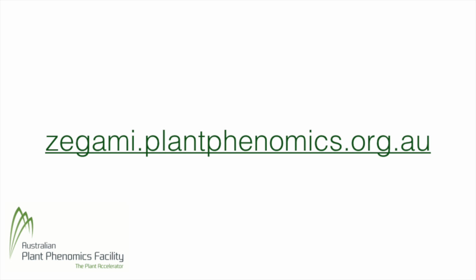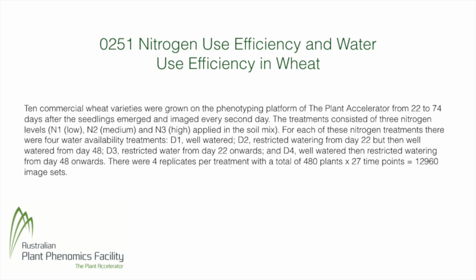Now you know where it is, let's talk about what it does. Zegami allows users to filter, sort and chart data with the unique feature of being able to group that data with the corresponding images. As our example, we're going to look at experiment 251. Here, Dr. Trevor Garnett is investigating the nitrogen use efficiency and water use efficiency in 10 varieties of wheat.